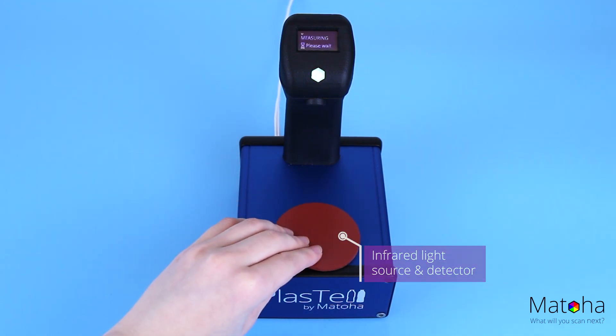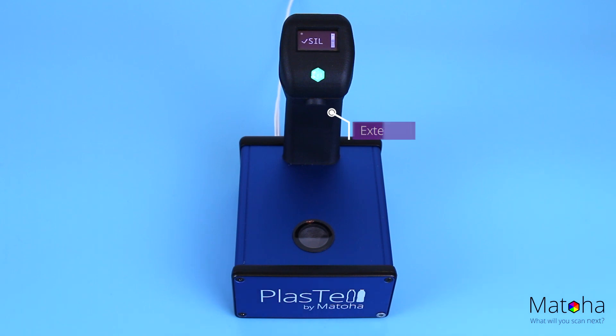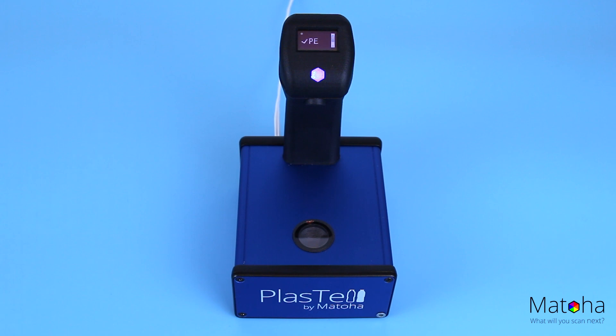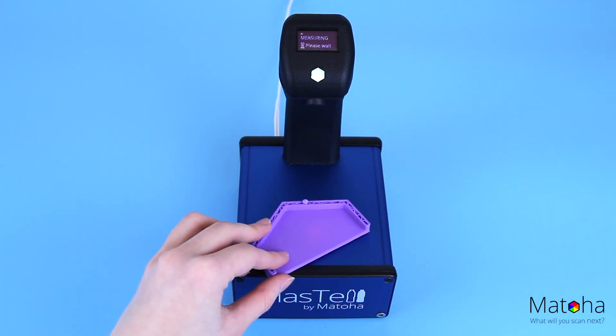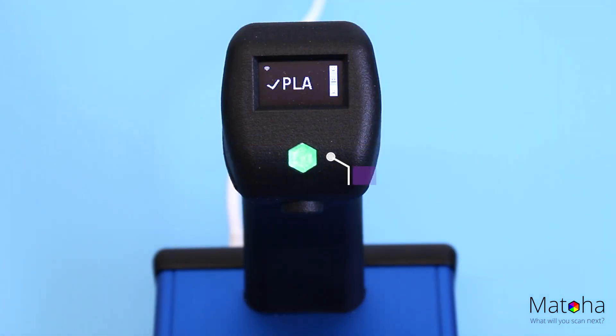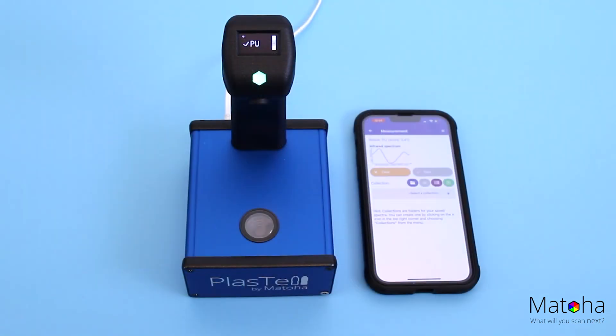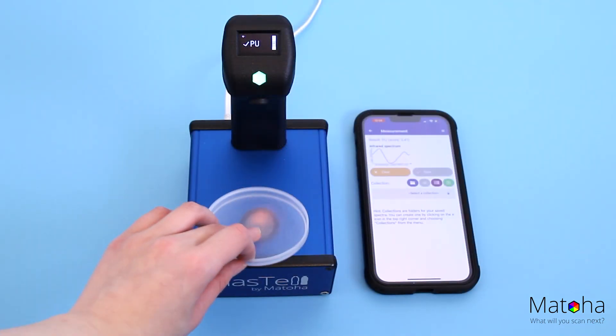The identification, thanks to our AI algorithms, is automatic and takes about one second. The plastic type is then shown on the screen and indicated with a colored LED. We support all major plastic types, and because it is so simple to use, no special training or scientific knowledge is required.